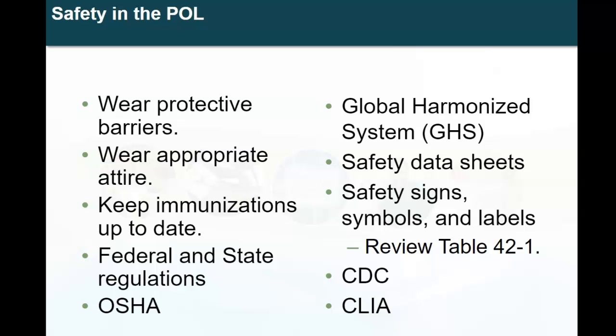Does that make sense? You will always find them in bright yellow binders with the words SDS written in bright red or black ink. And they should always be visible next to an eye wash station, next to a lab. You always want to have those hanging on the wall so you can see them, so that if you get exposed to a chemical, you can flip to a certain page and the information on how to save your life from that chemical is right there, okay?